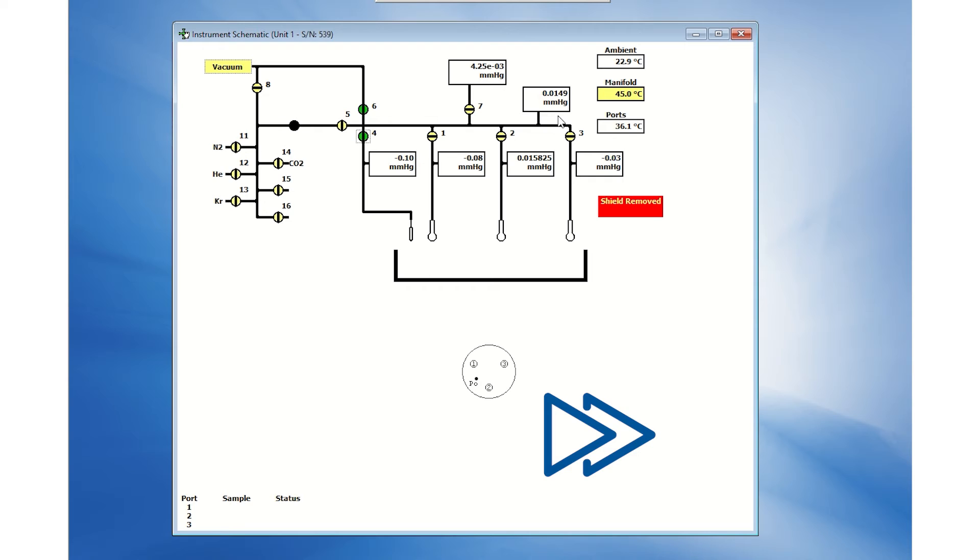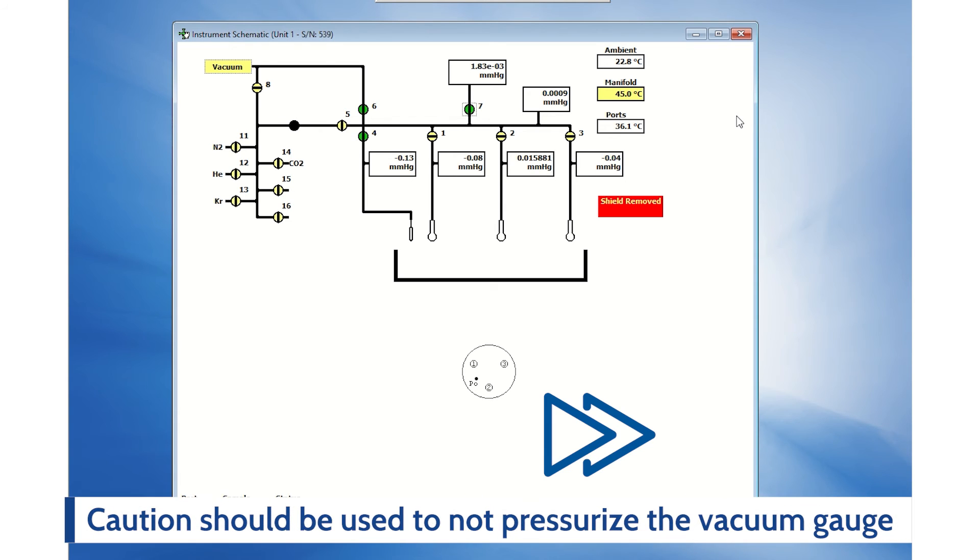Once the pressure reads near zero, open valve 7 to the vacuum gauge for lower pressure readings. Ensure to open valve 7 only when the pressure is near zero and keep it closed before increasing in pressure to prevent any damage.